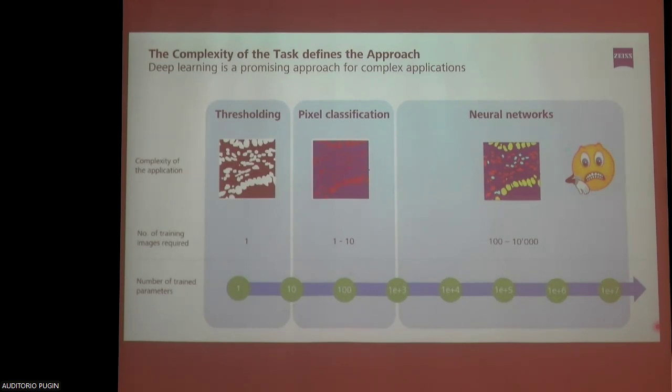So when you want to have fast AI processes to be executed, you need to have very strong GPUs on board, or you need to buy some, let's say, GPU power online in different cloud formats, and this is really the bottleneck nowadays. So either you have enough time and then it will be done within half an hour, or you say, okay, it is also okay to wait for 2 days or so for the model to be trained, and then it's not so costly. So time is money is the big but over here. But I think that is with every new technology.